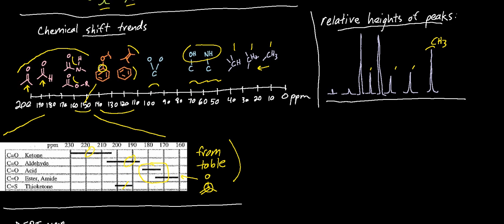If you see a peak that's clearly doubled, and we often see them in the aromatic region, this might be a case of a para-substituted aromatic where these 2 hydrogens are equivalent. Therefore, these 2 carbons are equivalent, and giving you a 2-carbon signal, 2 equivalent carbons here and here, for example. If they're very short, they're often quaternary carbons.